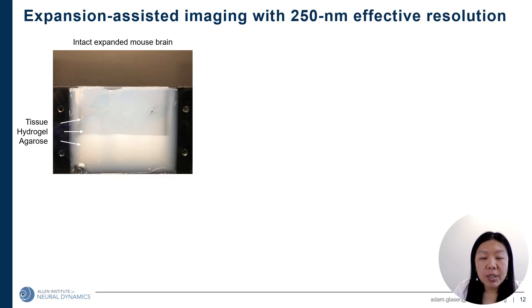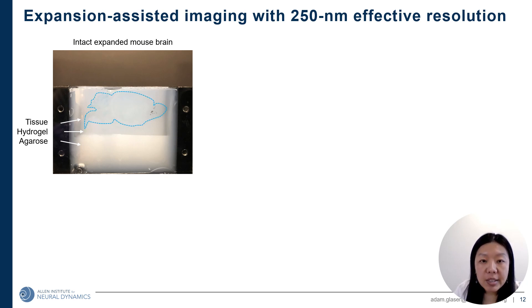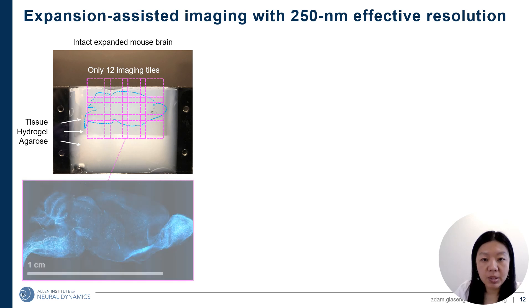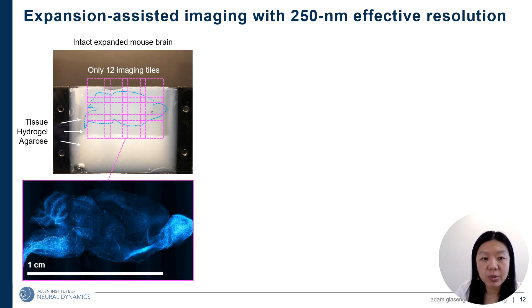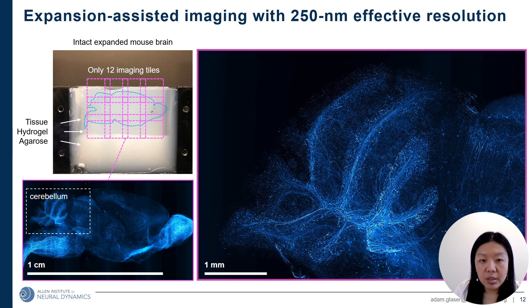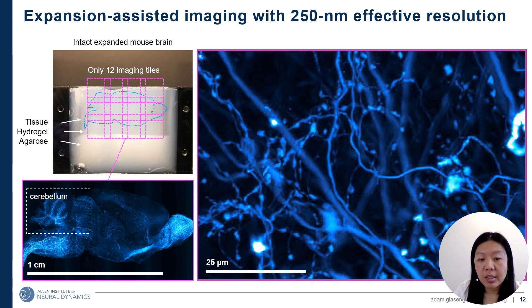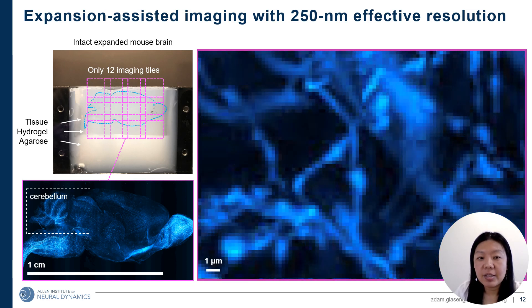Here are some example images taken by our ExaSPIM system. This picture shows an expanded brain mounted in a sample holder. The dashed line shows the shape of the brain. The brain was embedded in a hydrogel cube, and the image contains only 12 tiles to cover the entire brain. This is the whole brain image after stitching the 12 tiles. We now zoom into the cerebellum area, continuing to zoom in repeatedly until the smallest visible feature is about 1 micron.